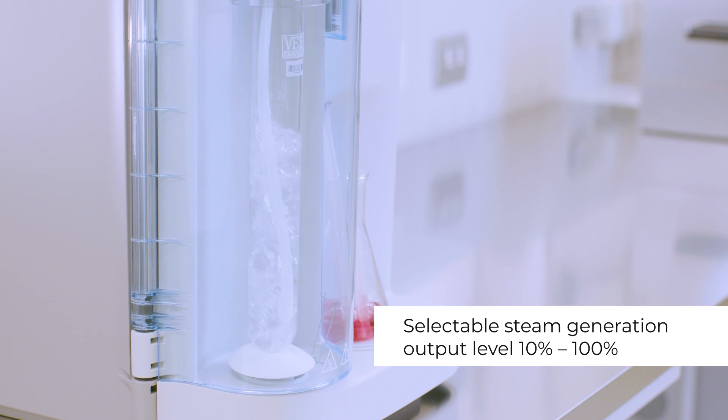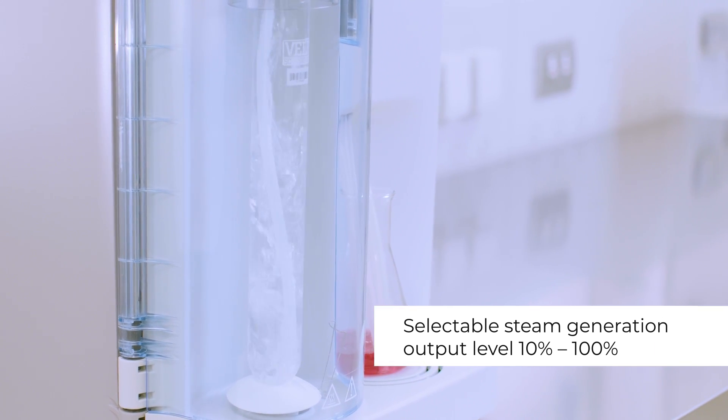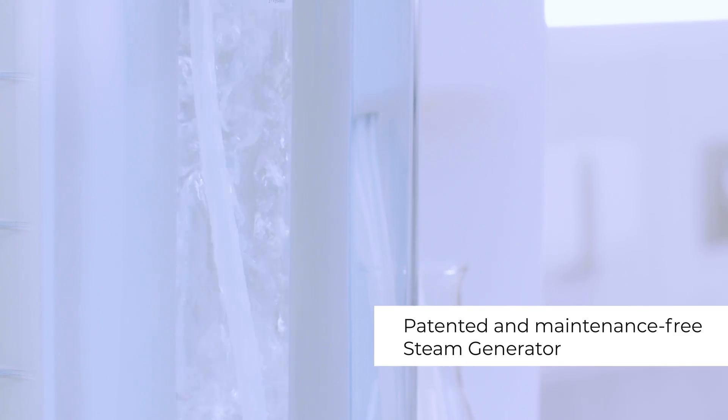The powerful steam flow with variable steam output ensures maximum versatility for any application requirement powered by the patented steam generator.